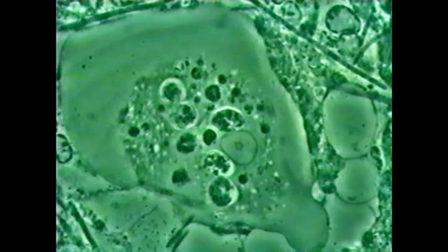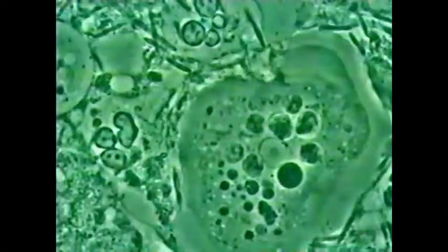Here a little more of those bacteria, bacilli, that remind us of Fusobacterium, orange complex, and some Vibrio, and also some spirochetes, reminding us of Treponema denticola, which is part of the red complex. So we see some bacteria, but most present is this enormous amoeba with the nucleus, karyosome in the center, and chromatin on the surrounding of the nucleus.